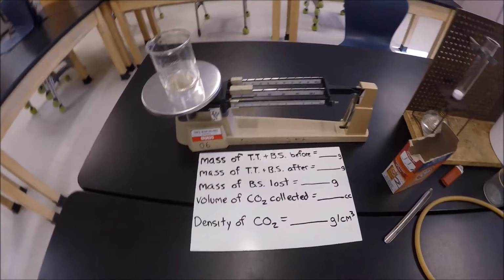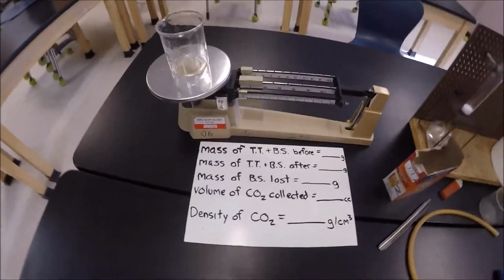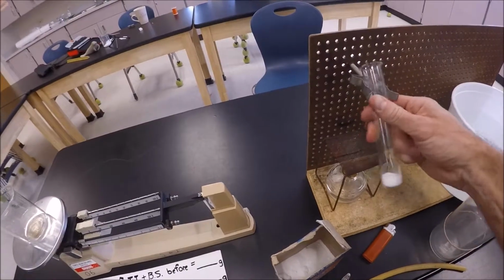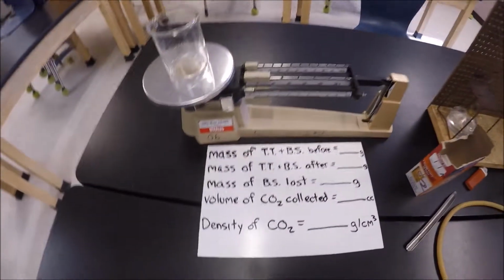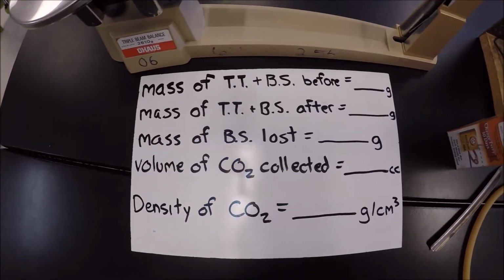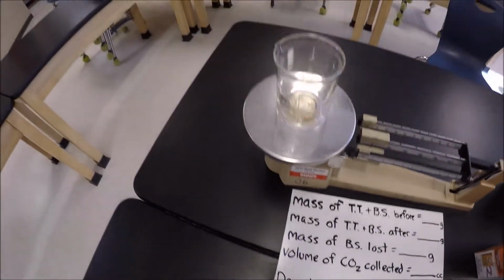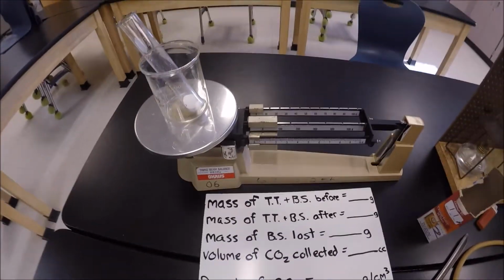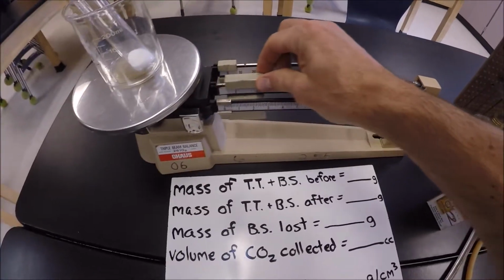Okay. So the first thing that we'll do here, after I added my baking soda to the test tube here, is we're going to go ahead and take, as you can see on the sheet there, we need the mass of the test tube and baking soda before. So we're going to go ahead and put those on the balance like this. We're going to go ahead and balance this out.